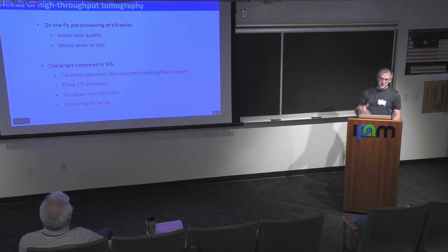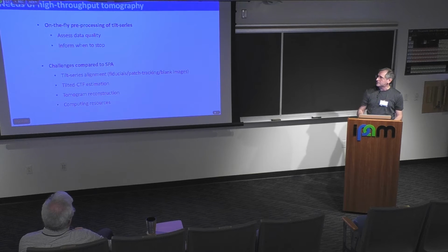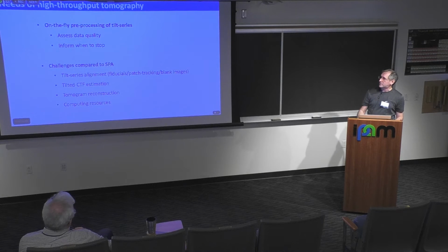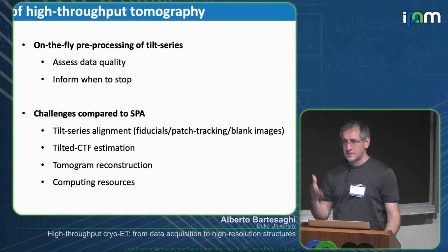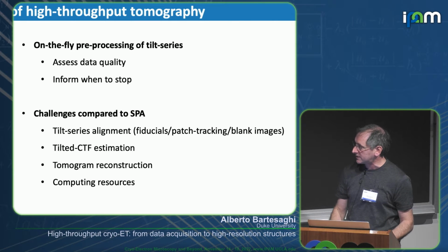Obviously one of the things that we use routinely in single particle is to be able to monitor the data quality as the data is coming out of the microscope, and that's very useful because it allows you to assess the data quality on the fly. Then you can decide, okay, I have enough good data, I'm going to stop, I'm going to go to the next sample. Now, we wanted to do something similar for tomography, but it turns out that that's more difficult. There are a lot more problems that you need to solve, and if this needs to run on the fly, everything needs to be automated, right? You cannot afford to be making changes as the data is being collected.